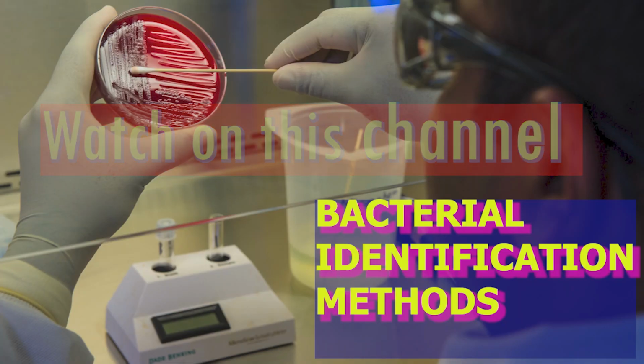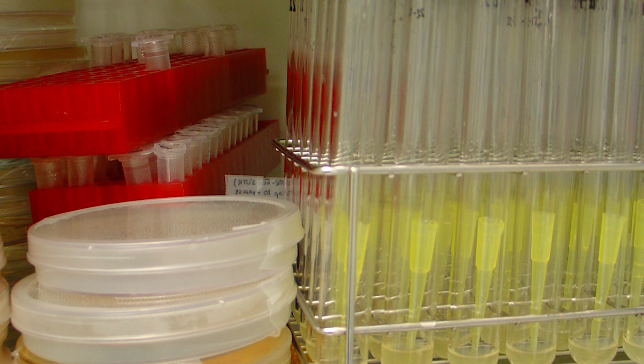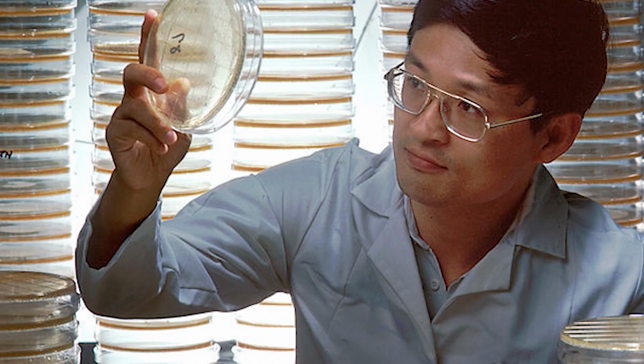Foreign bodies, IUD, plate as soon as the sample is received. No staining is required. Thioglycolate medium is enough for the growth. IV catheters, pins, prosthetic valves, no staining method, blood agar, and thioglycolate medium.